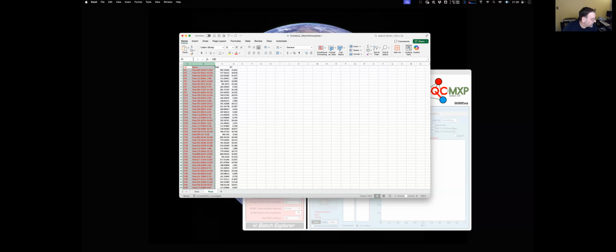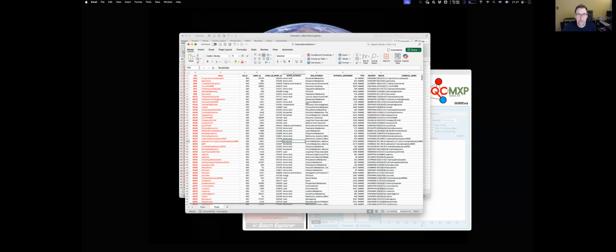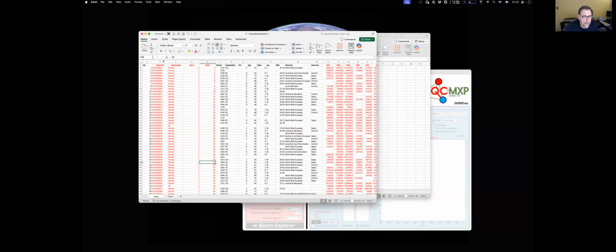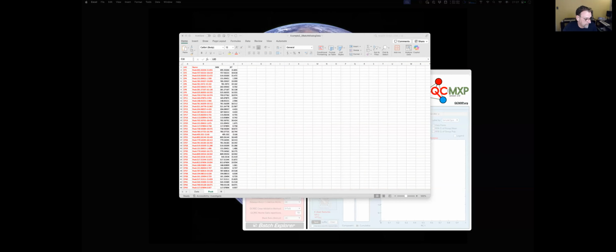Now, just for an example, let me see whether I can just pull this up. Okay, here's another example which is a bit more realistic. This is actually data from Metabolon, but you can see here in this example, it's got that same essential information that's needed by my correction software, but this has also got a lot of metadata that I use for statistics. It's perfectly fine to keep this metadata in your Excel sheet or your CSV file. It will just be ignored. And then equally with the peak table, with Metabolon data, we get a lot of information about pathways and chemical names. But all that's required for the analysis are these two columns, the UID and the name. So that's just a real world example from some data that Metabolon did for me.